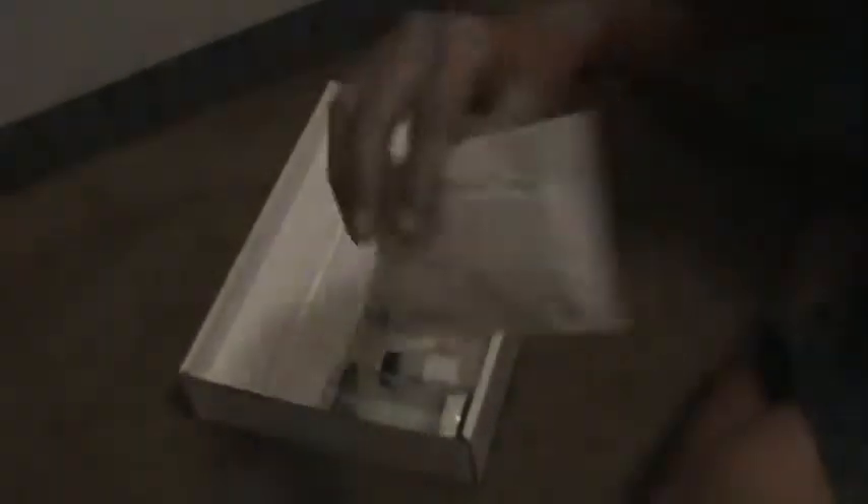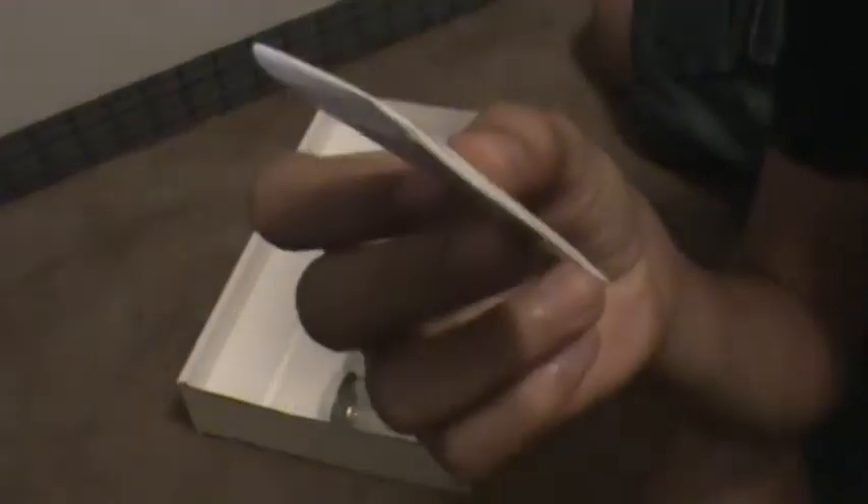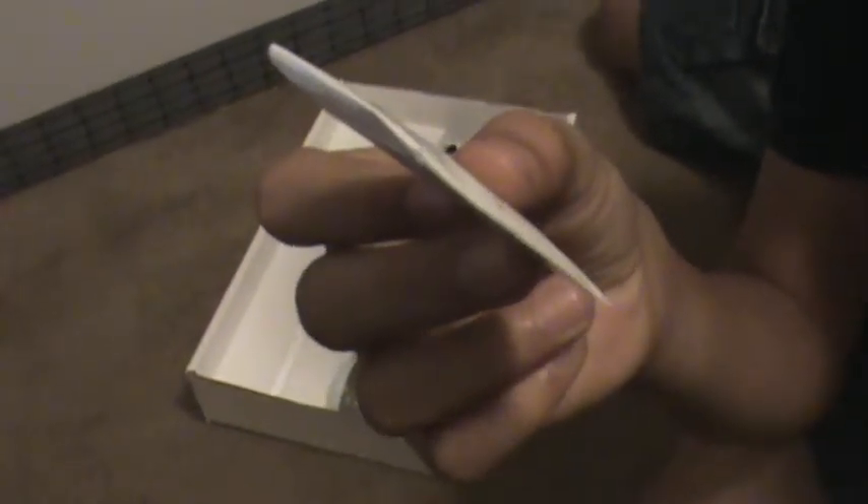It looks like we have some vapor tape, which is a type of insect trap. These here are a packet of BioQuip insect pins for pinning your insects. This is size 3, stainless steel, 100 pack. They get even smaller than that.